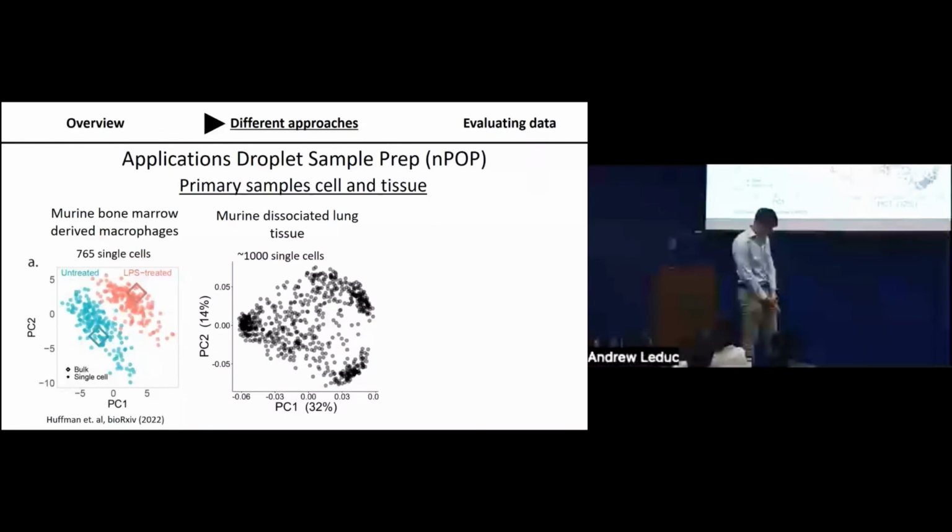Also from the chat, Stella asks, in the slide about monocyte macrophage differentiation, were those measurements based on DDA or DIA? Have you perhaps compared them? Yeah, so those measurements were made based on DDA experiments using the SCoPE2 approach, which uses an isobaric carrier. And I think that's a really great point.